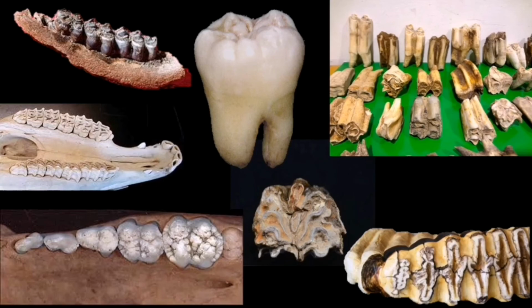You see, these are the samples. If someone gave you these kinds of samples, could you identify them? Which one is the human, the cattle, the pig, the horse, the deer? And if you know which one is the elephant tooth, that would be interesting. I have a specific fondness for dental structure studies. I like to study the teeth of animals because they're very unique.